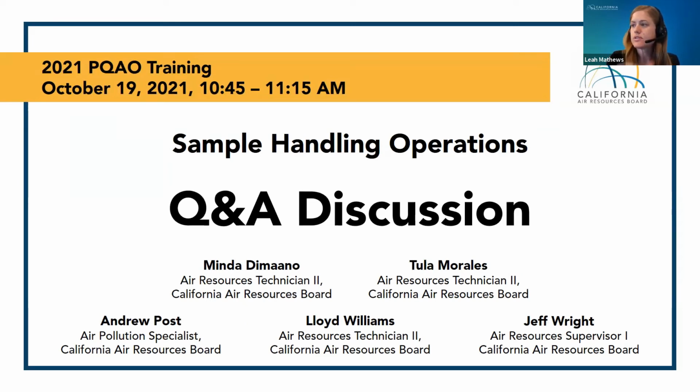We do have one question. Do you have an expedited protocol for filters that arrive warm, i.e. moving them up in the line or notifying the PM labs so they have a greater chance of being valid? Or is it always a first in, first weighed procedure? Summertime in the Central Valley is super hot and the UPS trucks don't have any AC in the back.